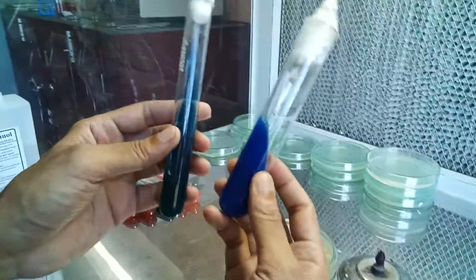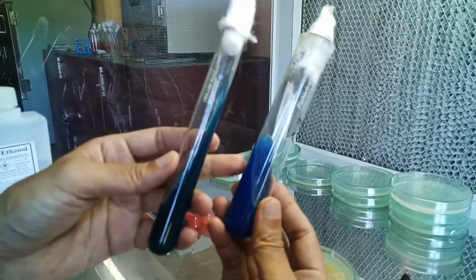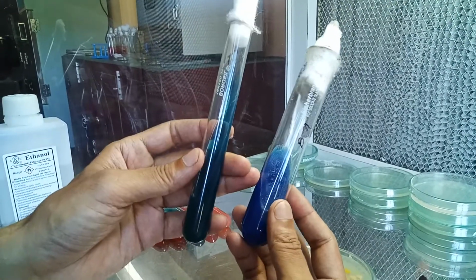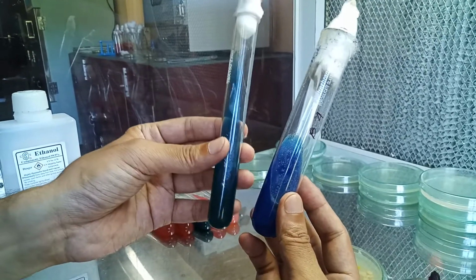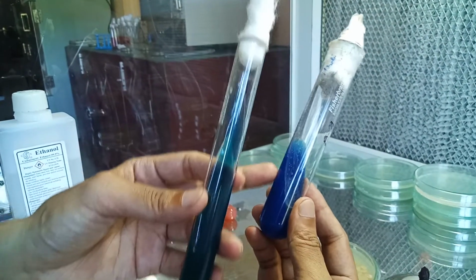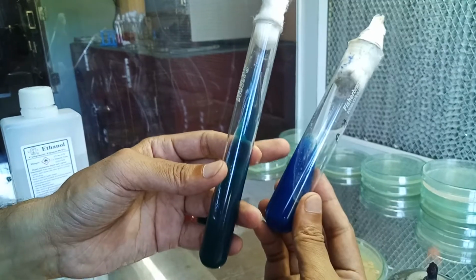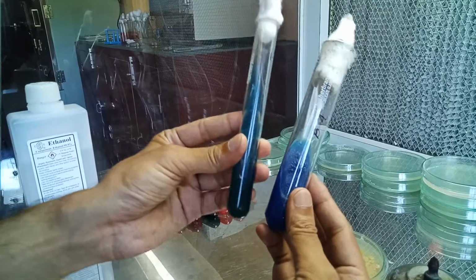Now we have one tube, and this is something that we had performed earlier, and if you can see, the color of this tube has changed from green to blue. So that is indicative of a positive result. So once the bacteria is capable of utilizing citrate, it will produce sodium carbonate, making the pH alkaline, and thereby bromothymol blue will become blue in color. So this is a positive result, and if it remains like this after incubation, then it is a negative result. That is how we interpret.